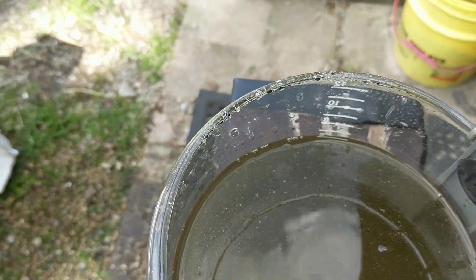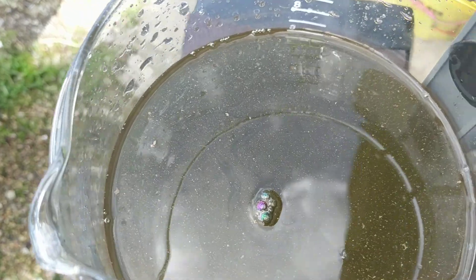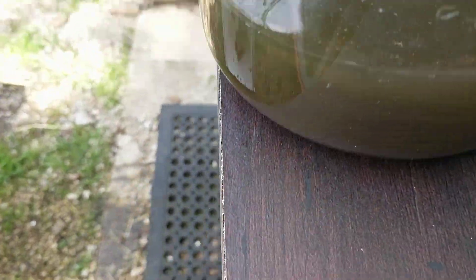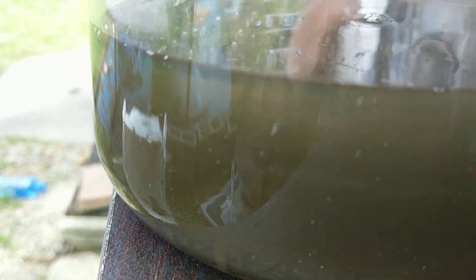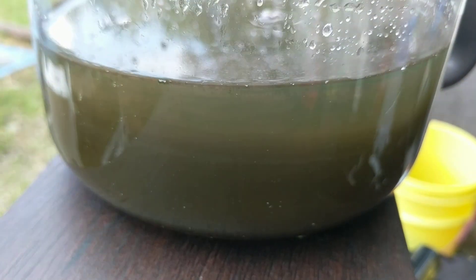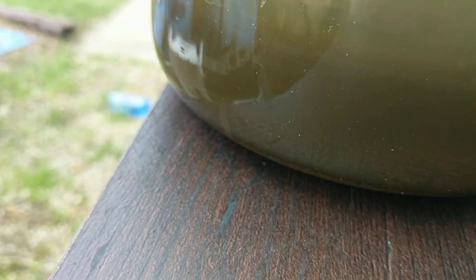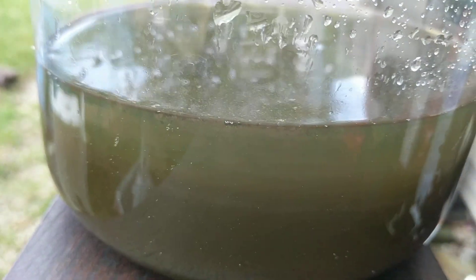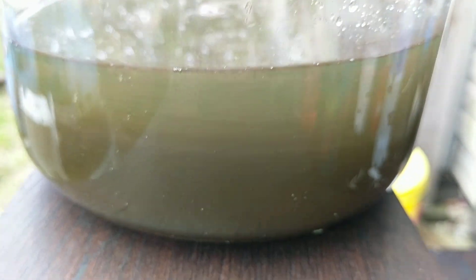By the looks of it, we got some gold appearing on top. This should be pretty pure. Doesn't look like much is in there though — it may just be because it's pretty diluted. But you can tell we're already layering, and we're only about a minute in.